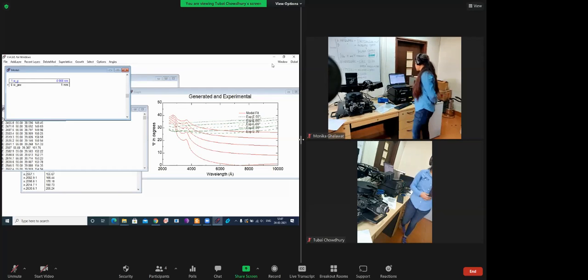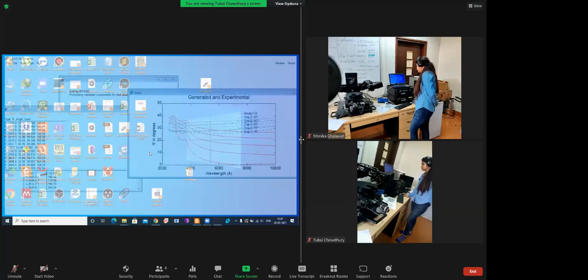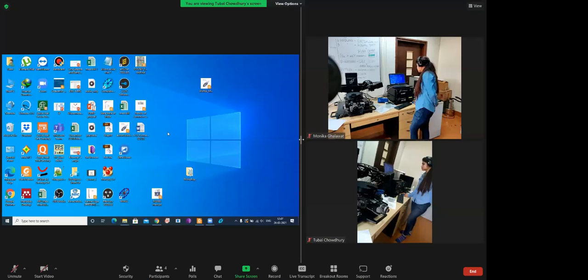Okay, so we'll go for other software. Okay, I will just close them. Shall I or you? Okay.